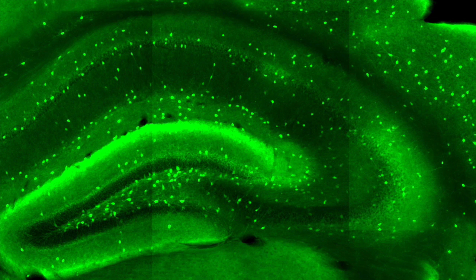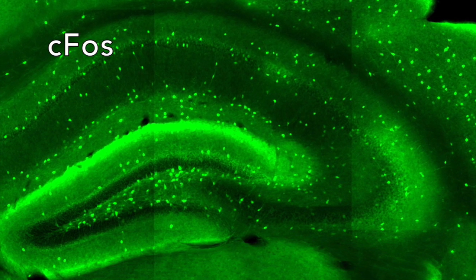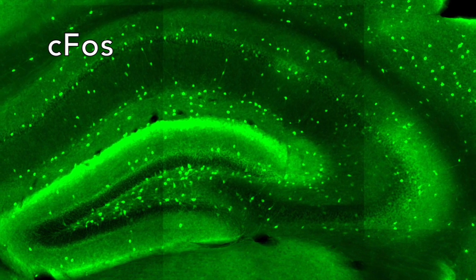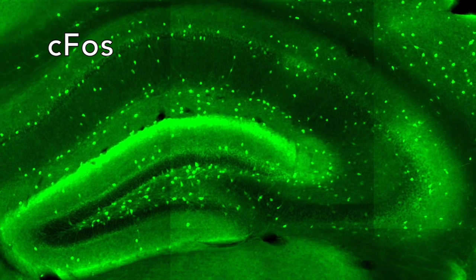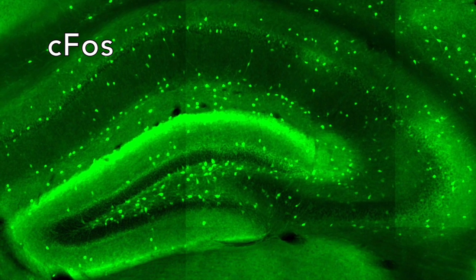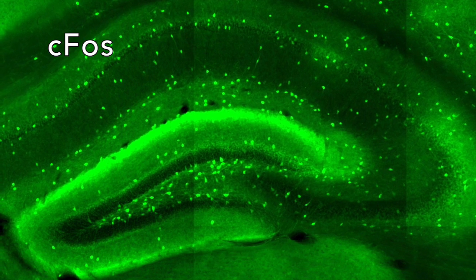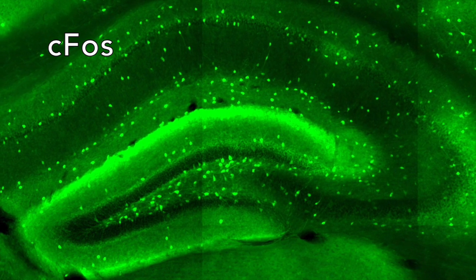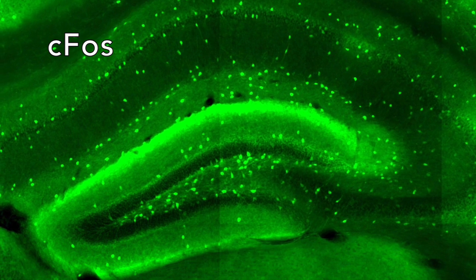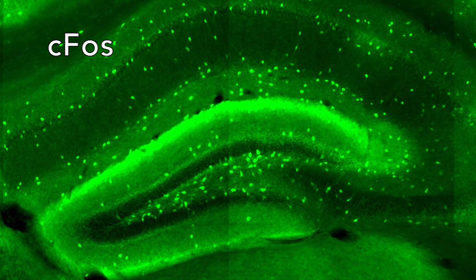In this example, all of the cells that appear green are CFOS positive cells. They contain the protein CFOS. This protein was bound by the rabbit anti-CFOS primary antibody, which in turn was bound by the goat anti-rabbit secondary antibody, tagged with a specific fluorophore that could be excited and detected using our fluorescence microscope.